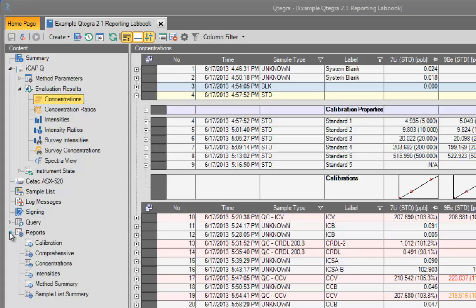A series of default report templates are included with QTEGRA. These cover the most basic requests and I will be using this labbook to generate a report using each of the supplied templates.